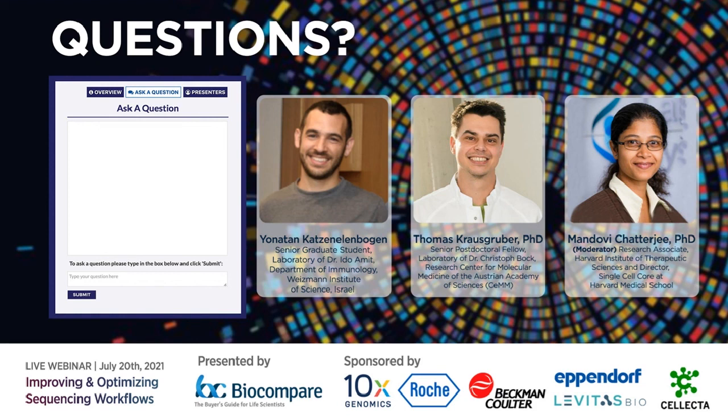Jonathan? No, I just want to agree with Thomas regarding the QC. In our protocol, we have two QC points. The most important one is the quality control before the first amplification of the library, because it reflects exactly what we have there. The second quality control is just before sequencing, and there we see how well it was amplified. So we're measuring a lot of things in these quality control tests. One is the quality of the initial material with which we started this process, and the second is how well it was amplified.